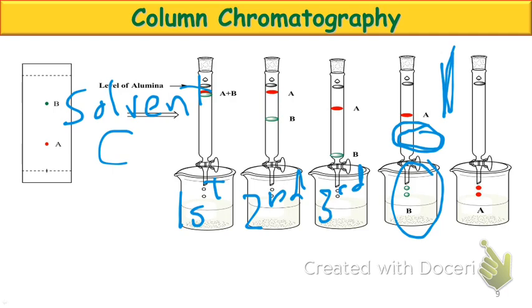And then we get to that very last case, which I guess we'll call fifth. Now I'm going to collect again in a separate container, because I don't want to collect more of the solvent along with it. My goal is to try and get these in as many different containers as possible so we can easily identify and separate each of these things. Make sense?